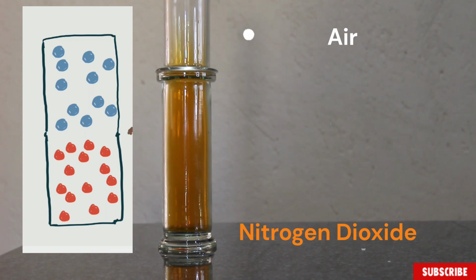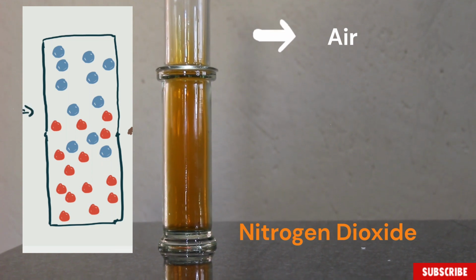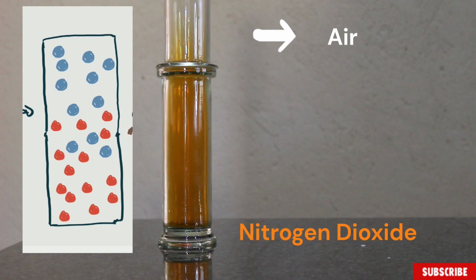This is, guys, another indication that there is in actual fact space between the particles and the particles are moving. Otherwise, the particles of this nitrogen dioxide would not be able to mix with the particles of air.